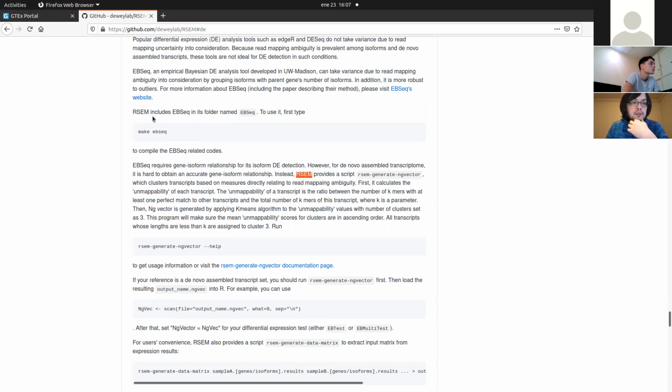It's a practice for you to get more familiar with other software and how they incorporate each other's functions together. I think it's a good practice. I don't know if it works because I never tried EBSeq. But I think I'm going to send you the script. We can just try now.